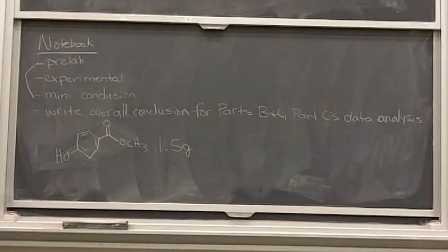So what I'm going to do now is go through the actual reaction, and then we'll look at the mechanism. The reaction itself: you're starting with this. This is a solid compound. You're going to dissolve it in ether. Then you're going to add pyridine to that mixture, and then you will be adding your acid chloride via syringe, okay? And from this whole mixture, you will then get your diester.